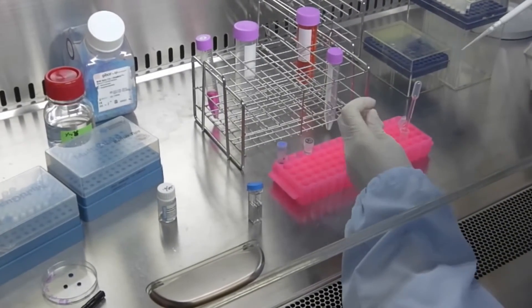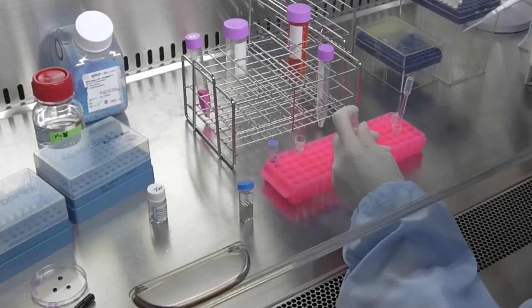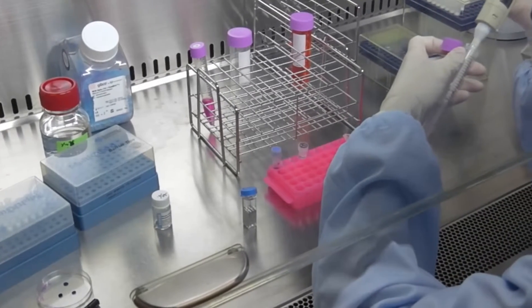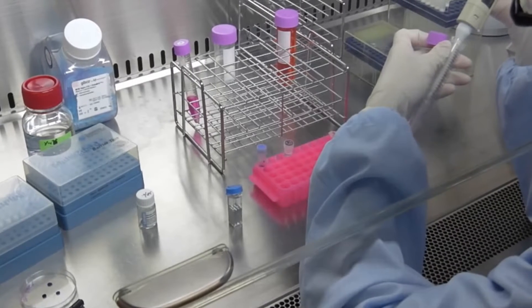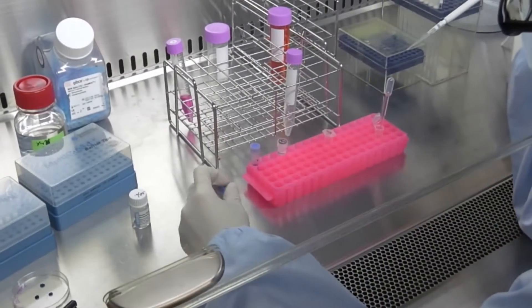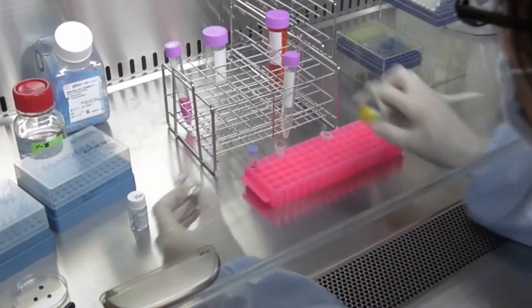The mononuclear cells are resuspended with 103 microliters of transfection reagent, and the mononuclear cell suspension is transferred into a cuvette for transfection. Be careful to avoid bubbles in the cuvette.